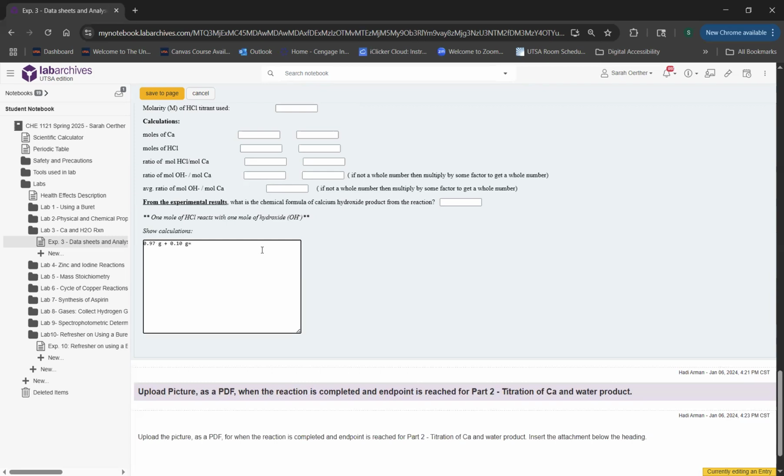And then also show your result to the right number of significant figures, 1.07 grams. So these are these areas. It's important to note when you're writing out your calculations to kind of title them. So you can say sum of masses or taking the average, whatever you think will best describe what you're doing.